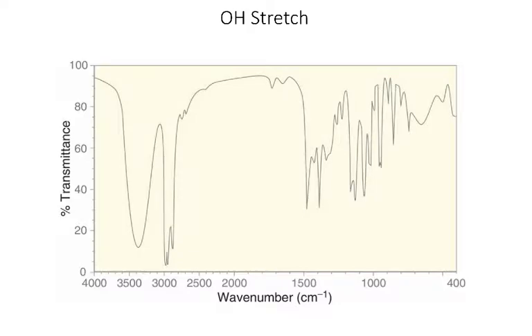Right, and so let's look at some examples of the things that I'm looking for. So when I see this broad peak, sometimes I hear this described as a sword. Right, this is a dead giveaway that I have an OH stretch. It's very recognizable.